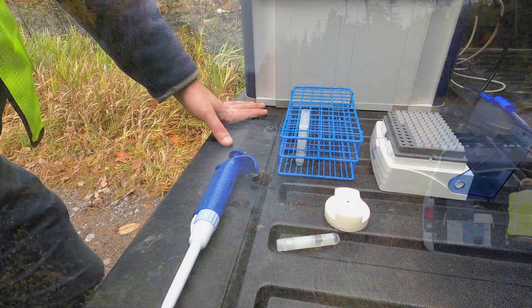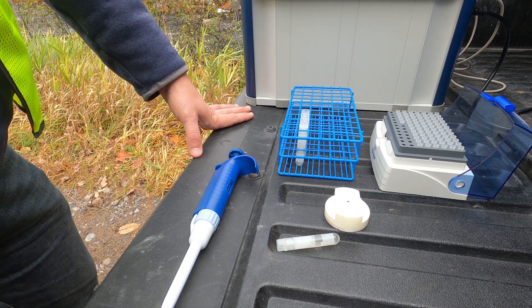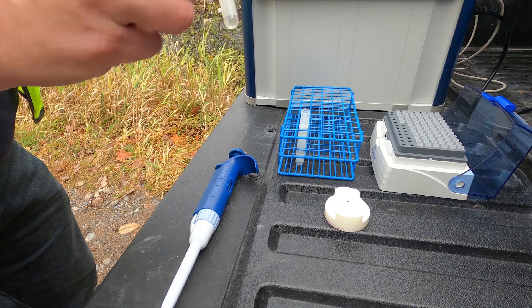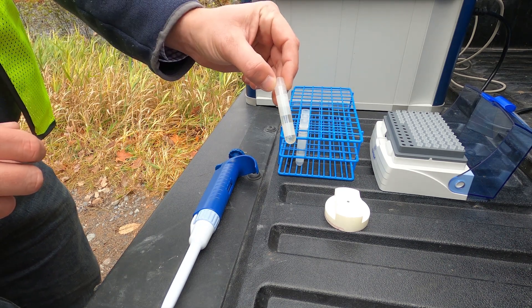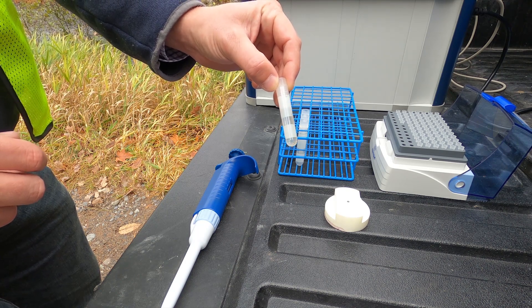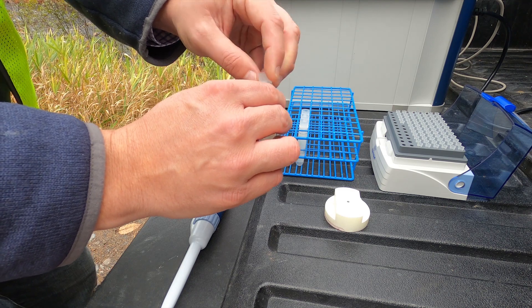Today we're going to prepare a sample for trace elemental analysis with the S2 PicoFox TXRF instrument. First we've collected our water sample — here we have one milliliter of water — and to analyze all of the trace elements in the sample, we are going to add an internal standard.